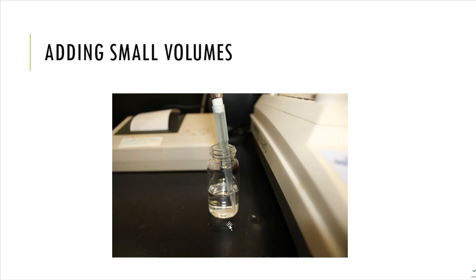All right, so here's my unknown. So we're going to call this UNKA. So this is my unknown A that I grabbed, and this unknown A is a liquid. It did have an odor to it. It didn't really have a fruity odor. It had a chemical odor that was associated with it, but it wasn't really fruity, but it was kind of that way. So sometimes in the observations, it's very difficult for us to maybe describe what we smell, especially, but sometimes describe what we see. But in this case, that's pretty easy. This was a clear liquid. There was no color, colorless.